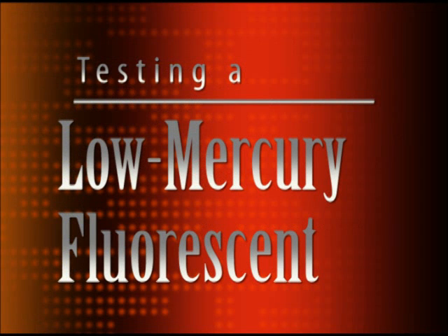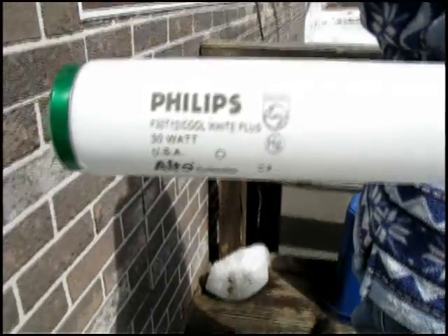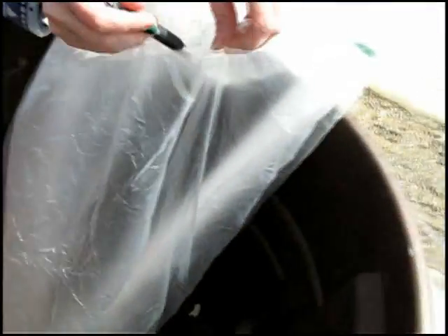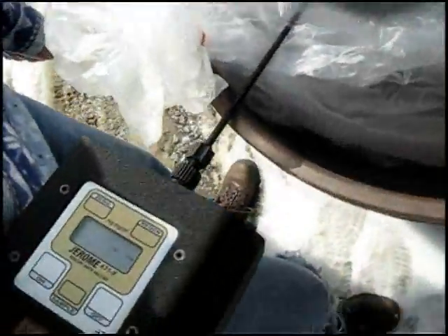Next, we decided to test a low mercury F30 fluorescent bulb. The green end caps on the bulb denote that this is a low mercury or green bulb. So again, we put the bulb in a bag and poked our hole just as we had done previously. We then took 10 measurements inside the bag with the bulb unbroken.